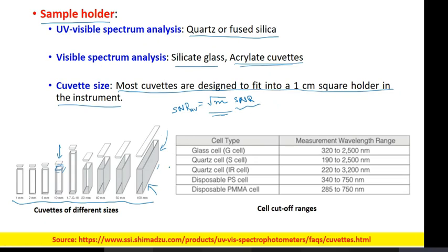Now, you do not have to do multiple number of things, but if you expose it for a longer time and then record it at different instances and then average it, it will help you in getting a good signal to noise ratio. And this is where, if you have to do this kind of analysis where you have very dilute concentration of the analytes, the CCDs come into place. Since CCDs have very high quantum efficiency, even a small change in the intensity can be easily picked up by the CCD, and in its inherent mechanism of how it detects the photons, it has the inherent mechanism of averaging for a longer period of time.